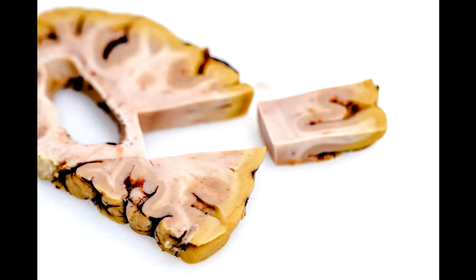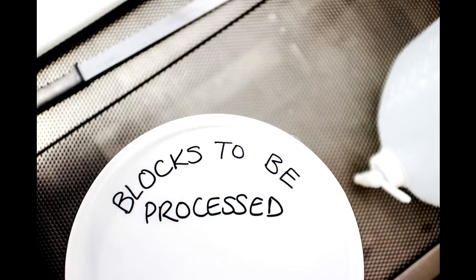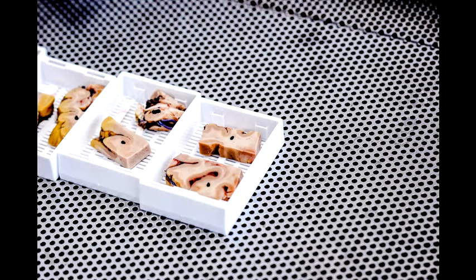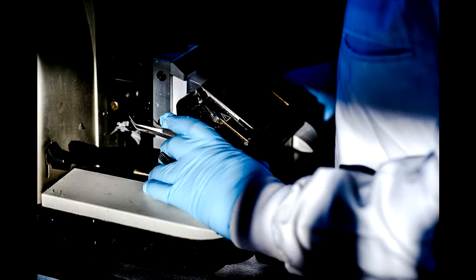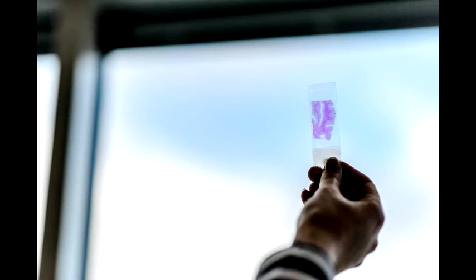These blocks of tissue then go into the processor which, over the course of about eight and a half hours, uses a mixture of graded alcohols and chloroforms to gently draw out all of the water from the tissue and replaces it with melted paraffin wax, giving the tissue a lot more structure. Those pieces of tissue then get embedded into blocks of paraffin wax and can be cut on a microtome, which can cut incredibly thin slices that are seven micrometres thick — seven thousandths of a millimetre — so that the slice of tissue is less than a cell thick, allowing us to see individual cells under the microscope.